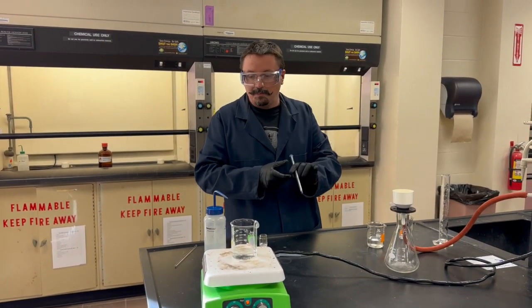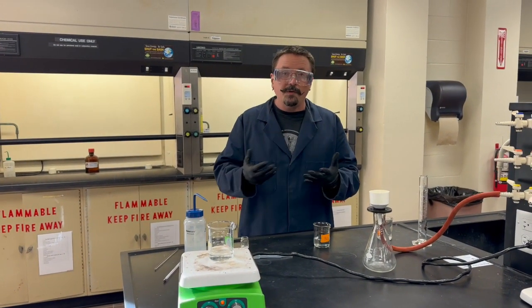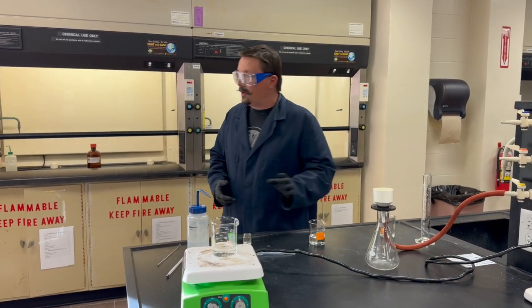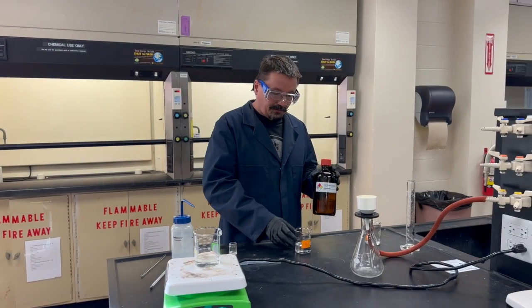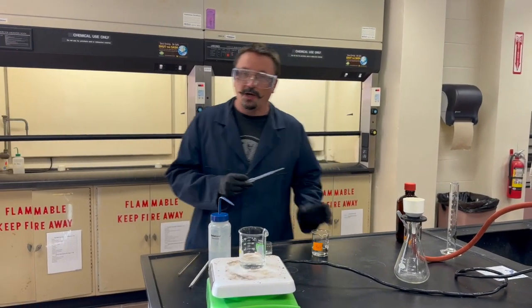Next we need to precipitate out the sulfate with barium. We have to make an insoluble precipitate of a known composition, and we're going to use barium chloride for that. You'll find barium chloride in another hood — get your 25 milliliters of barium chloride, and once your solution is at the appropriate temperature you can turn off the hot plate.